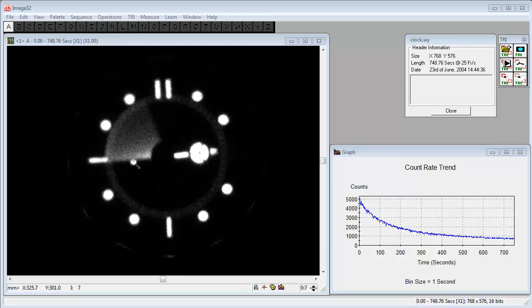Around the side of the watch we can see the time markers, the o'clock, 5 past, 10 past, and so on around the periphery of the watch face, and we can also see in this case the minute hand. As the minutes sweep past from the quarter-past position to the 10-past position to the 5-past position, we can see the amount of signal reducing as the phosphorescence decays.